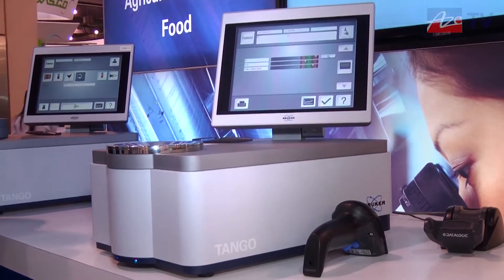Good afternoon. My name is Dean Roberts. I'm the manager for the agriculture, food, and feed applications for Bruker Optics. We're here at PitCon 2013 where we're introducing the Tango near-infrared spectrometer.